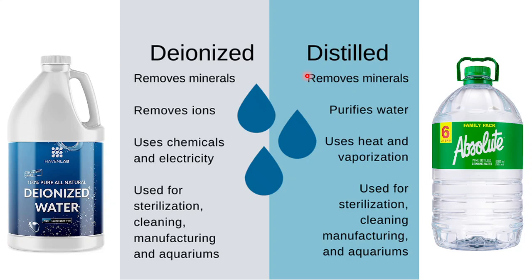Kay in the distilled water, mao siya ang purified water, and undergo siya sterilization, distillation, and many more. So, kining deionized water, lahi po niyang proseso. Now, if deionized water is not available sa store, then you may opt to use distilled water.